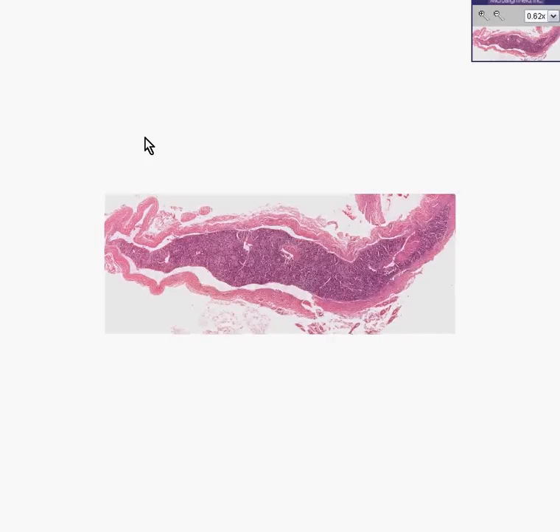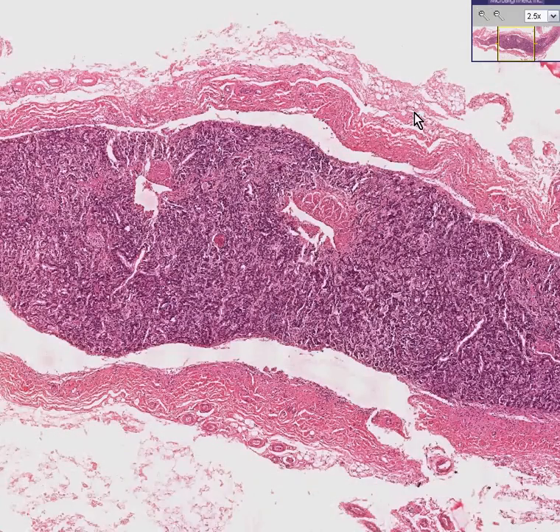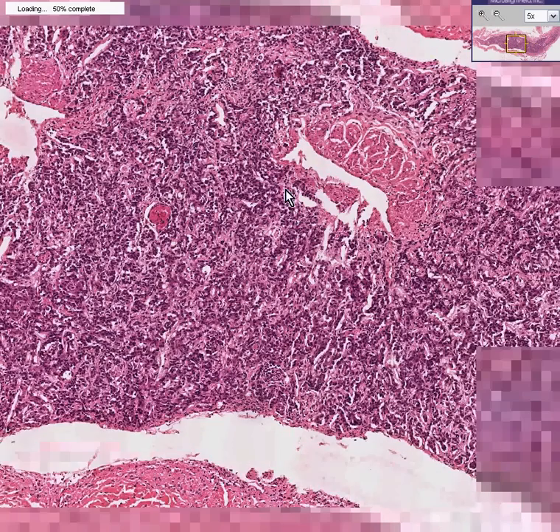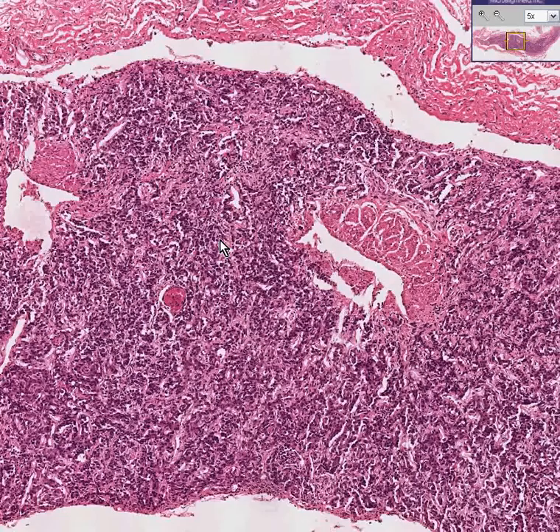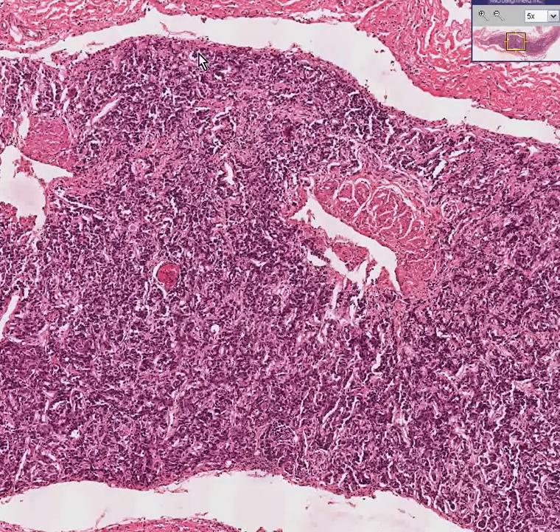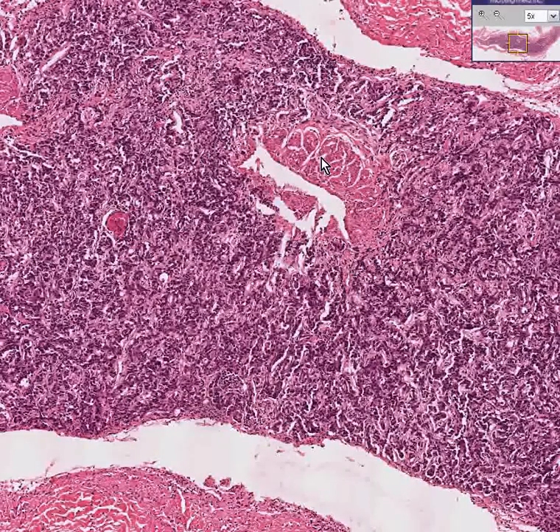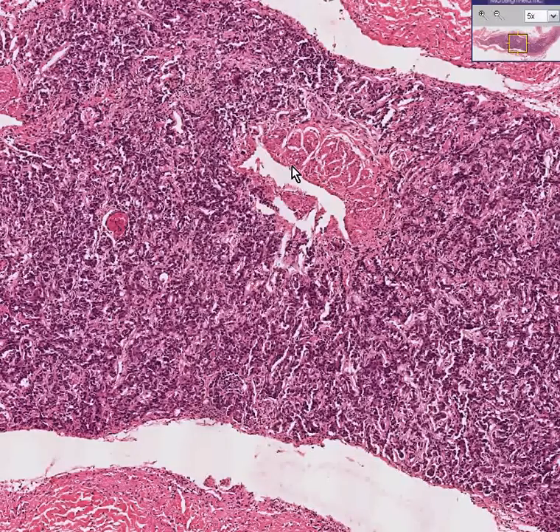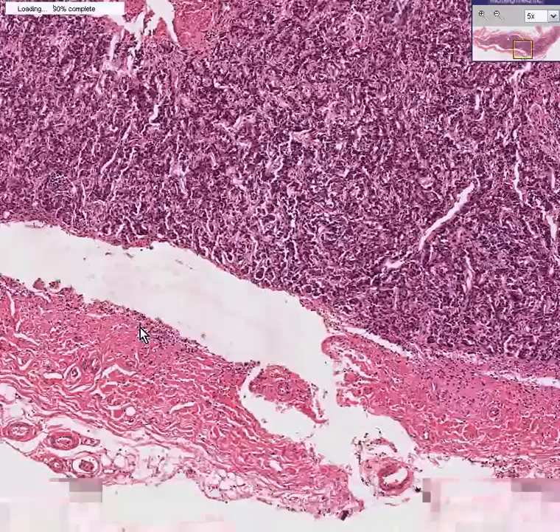Here is a piece of tissue. Perhaps you can recognize it as an adrenal gland — perhaps not. I could see why it would be difficult, because in a normal adrenal gland, besides having the capsule, we have cortical epithelium differentiated into glomerular areas, linear fascicles, and a reticulated pattern, peripheral to an area of medulla with large veins surrounded by thick smooth muscle. Here, you really can't see much of that differentiation at all.